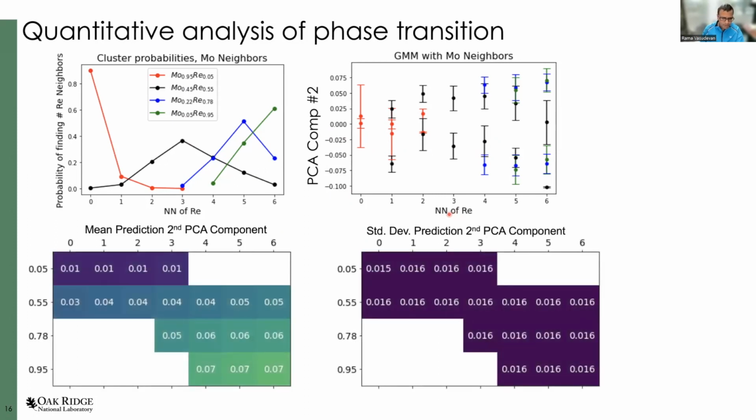So the long story short here is that this is getting a little bit technical, but we can quantitatively match the symmetry breaking distortion to the local chemical environment in this particular system. And we can find that we have a strong statistical predictor of the phase transition based on the local chemical environments themselves, which are more highly predictive than the chemical compositions themselves. This allows us to look at the drivers of phase transitions just through local atomic analysis across a composition series. So we haven't actually had to do any simulations in this case.